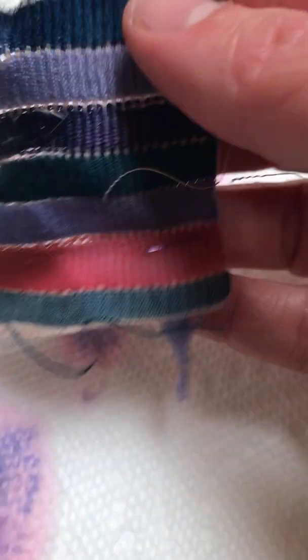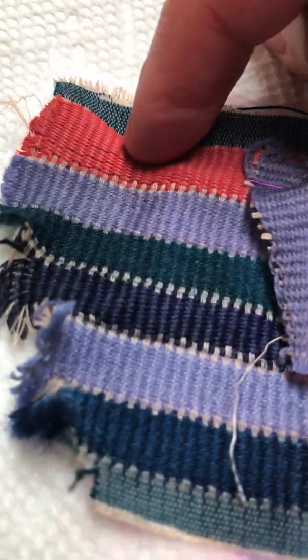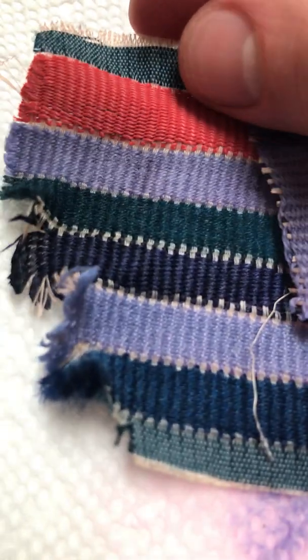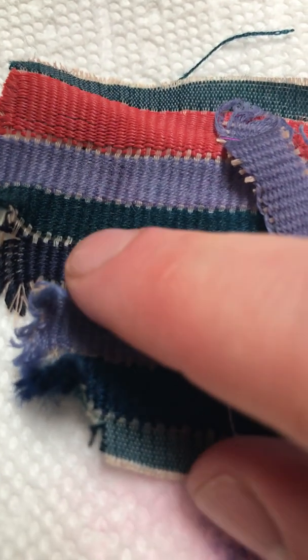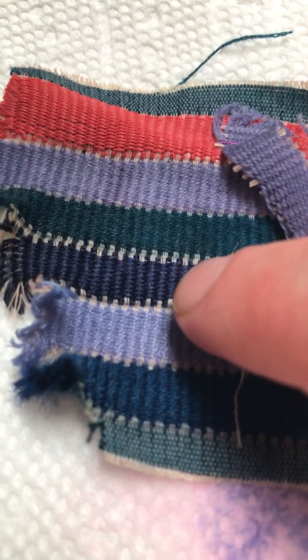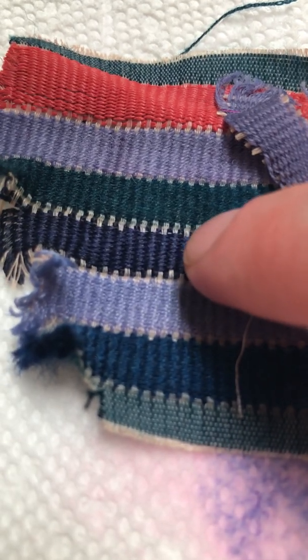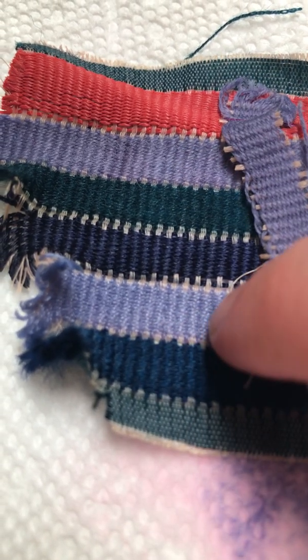So here's the end result with our fibers, with our unknown. You can see up here at the top: this was our acetate, which dyed a very beautiful orange color. Then we have our cotton, which is kind of a lavender. Our nylon, which is kind of a blue-green color. Our silk, which dyed almost like a navy or royal blue color. Our viscose, which is very similar to cotton — kind of a lavender color.